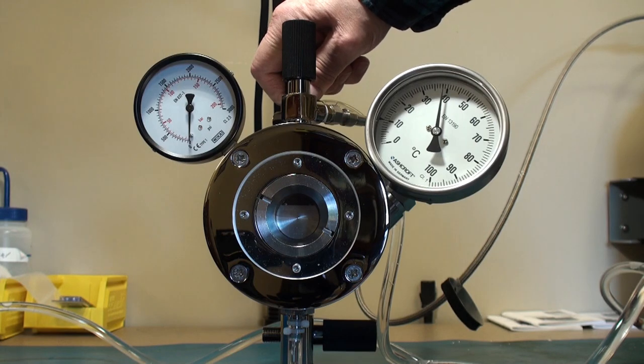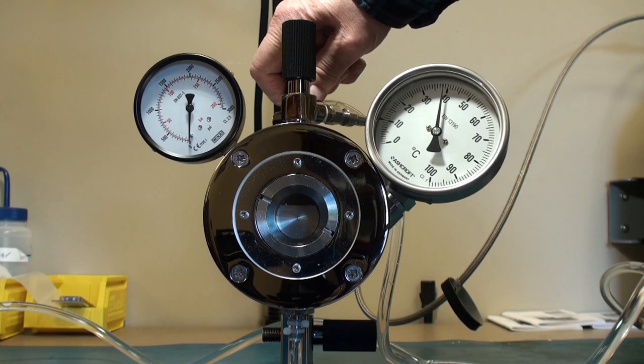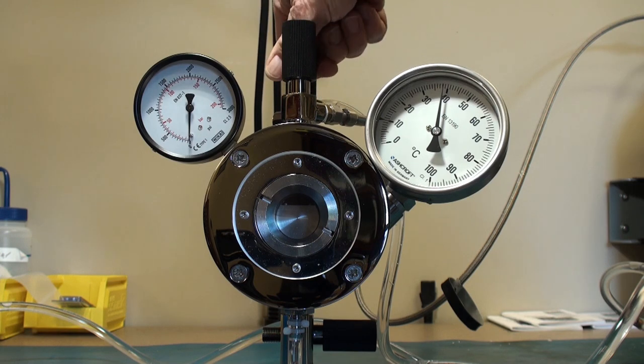If you can hand tighten the valve and it still leaks, well then it's time to have the valve rebuilt. There are rebuild kits available. You can take the valve apart and replace all the inner components. And that usually solves the problem.